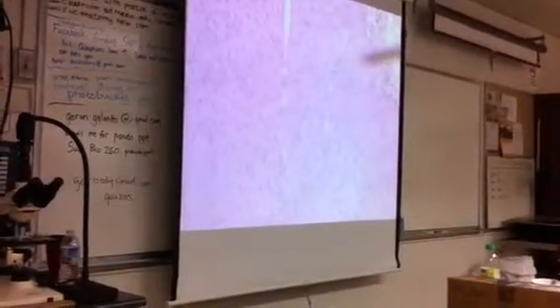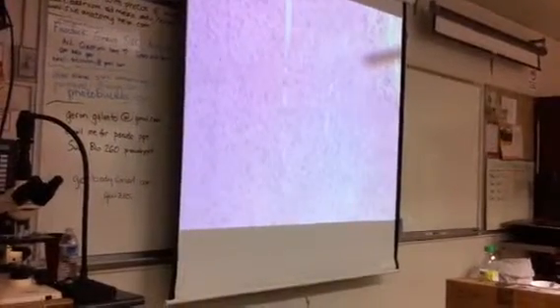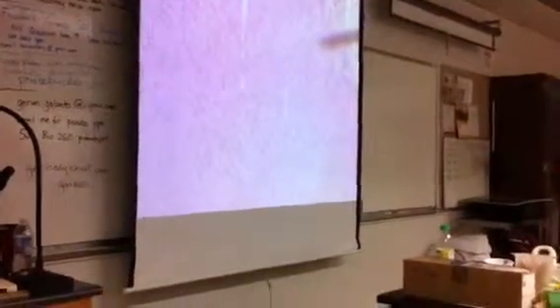So those are the 4 slides which sort of cover this unit: a neuromuscular junction and the 3 kinds of muscle. So that's all I got. Pretty simple.